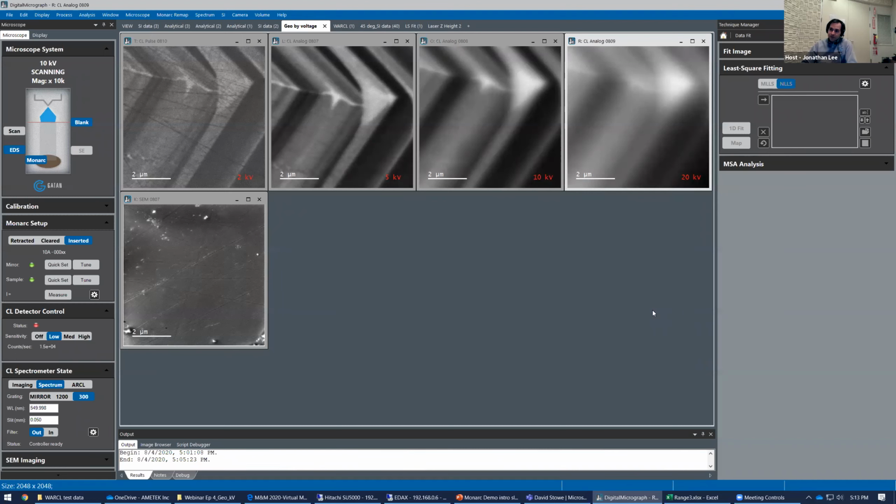Basically, as well as you can focus the microscope is the size of your spot, because you just penetrate the sample. But in that case, you're losing a lot of signal from the thinness of it, so a lot of those electrons will escape.